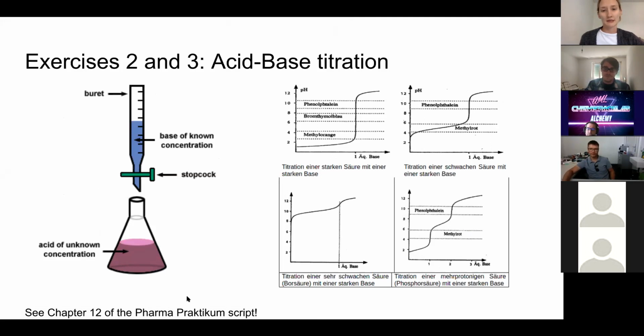So there were acid-base titrations, and then there were some others like complex metal titrations, like more complex versions. But for the programming exercises, we'll only be looking at acid-base titrations, as I think there's enough to work with there. So in an acid-base titration, I've tried to indicate what you would do in a lab in the left diagram.